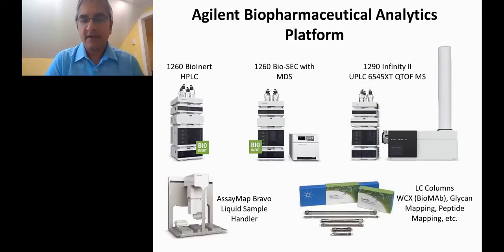And of course, the coolest toy, which is our favorite, is the 1290 Infinity II UPLC linked to what was at that time really the state-of-the-art Q-TOF MS, because I think when we got this instrument, only two other labs, including a test lab, had it. We are pretty pleased with this instrument in terms of the capability in analyzing biopharmaceuticals, as will become evident in the later part of the talk.